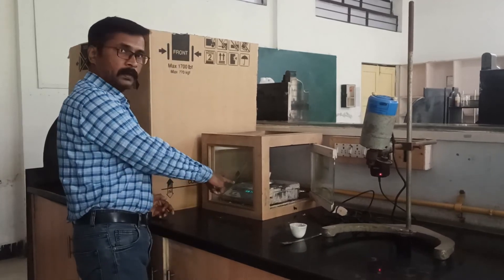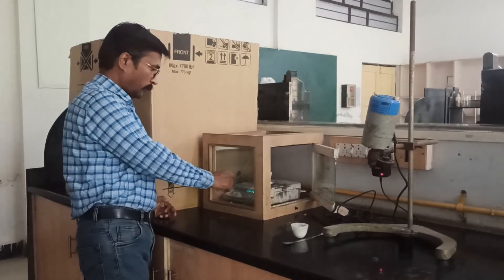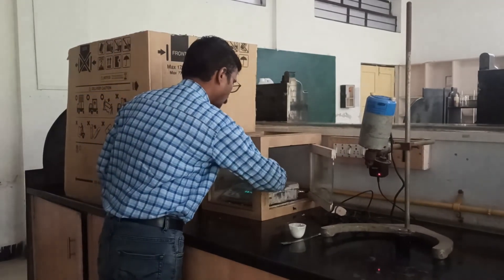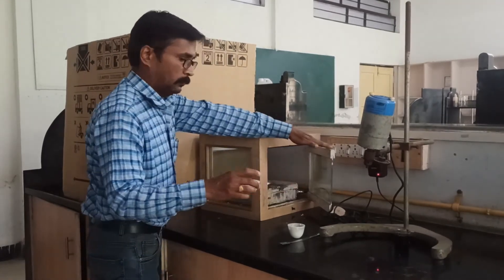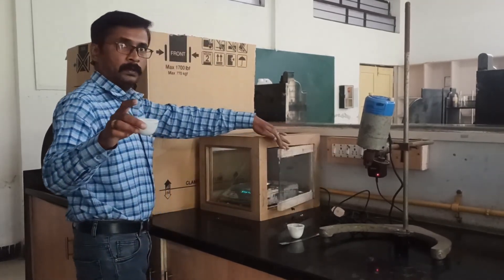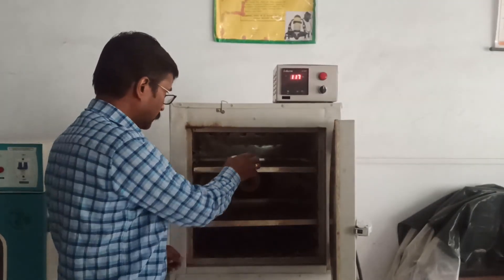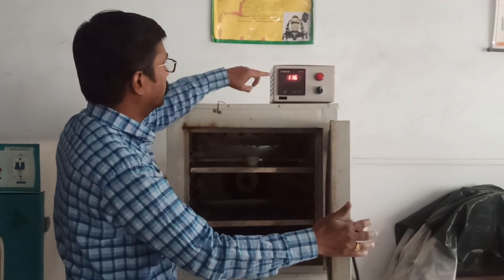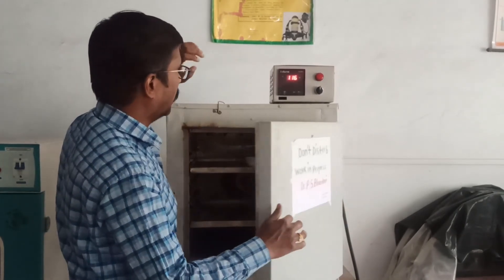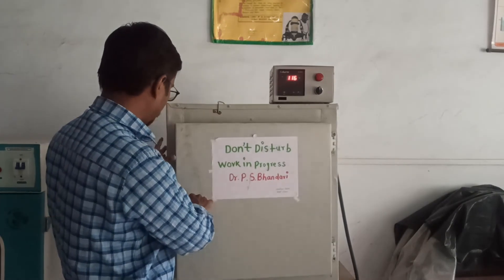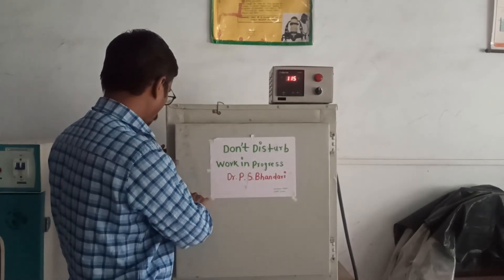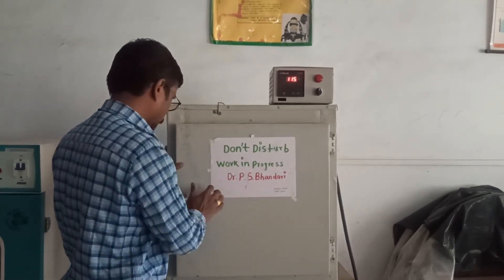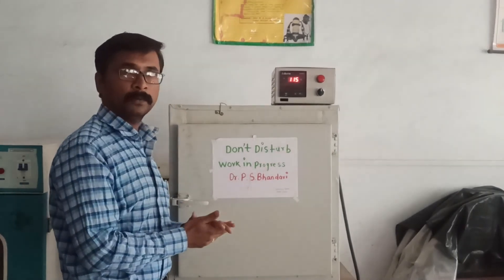Here the 5 grams of sample is placed. We will place the soap sample in a hot air oven at 110 or 100 degrees Celsius for one and a half hour.